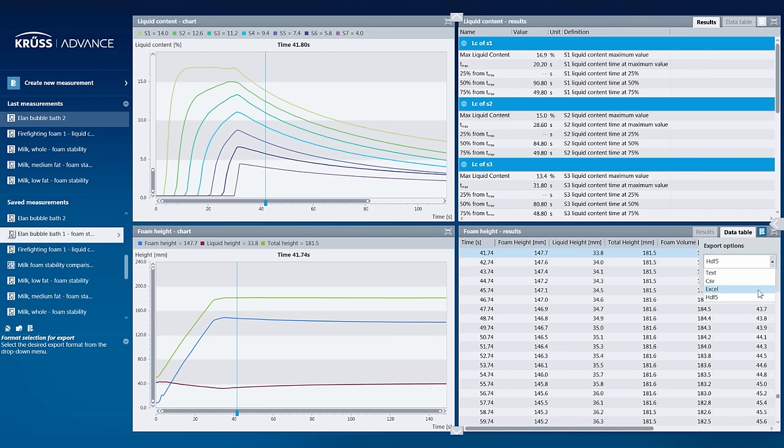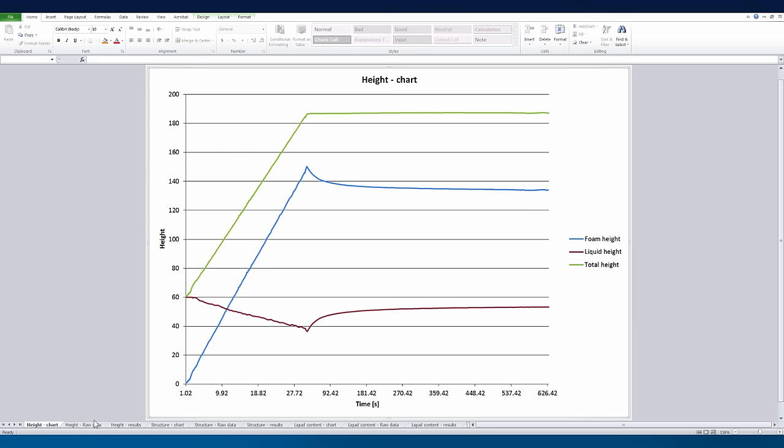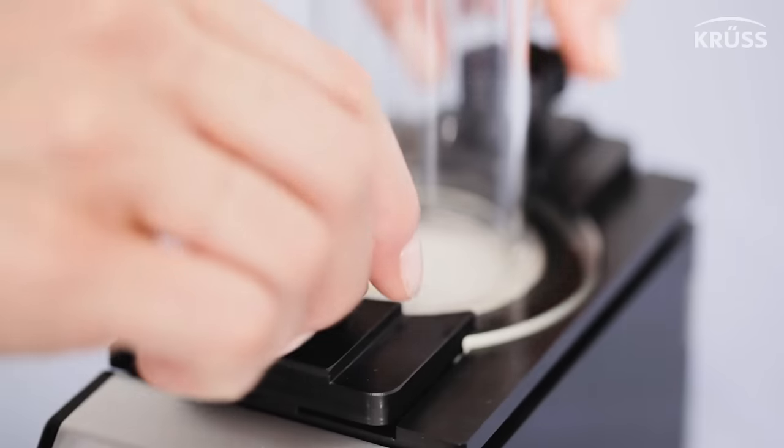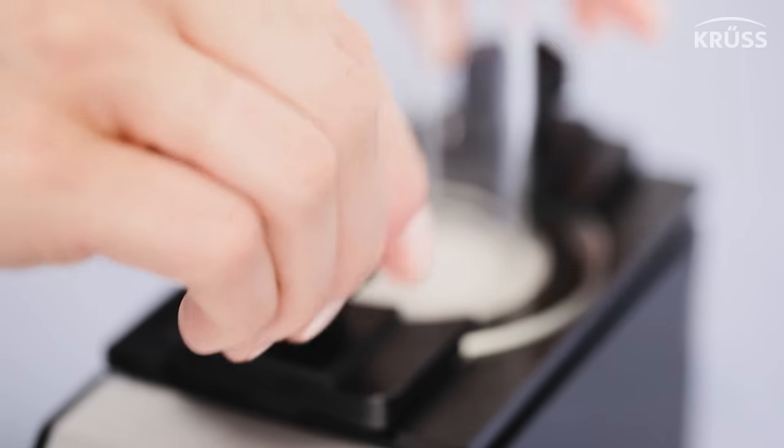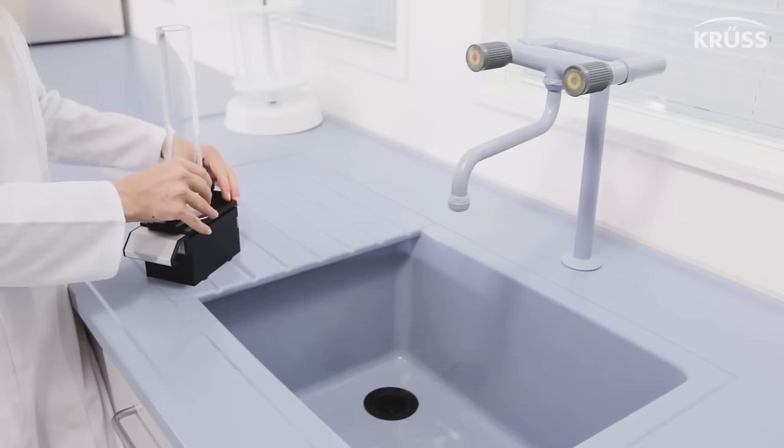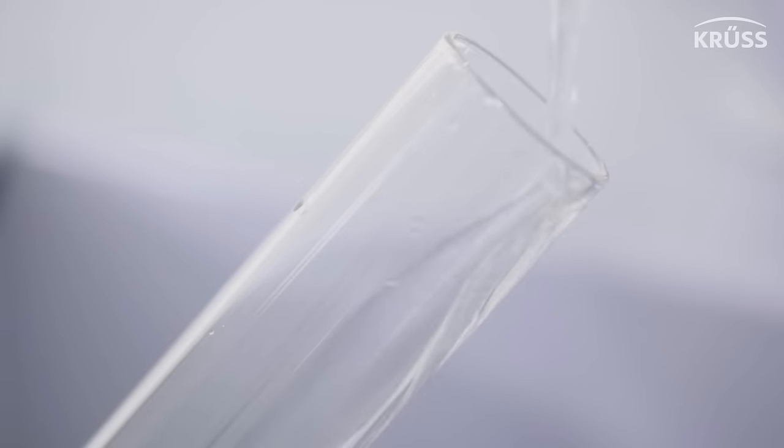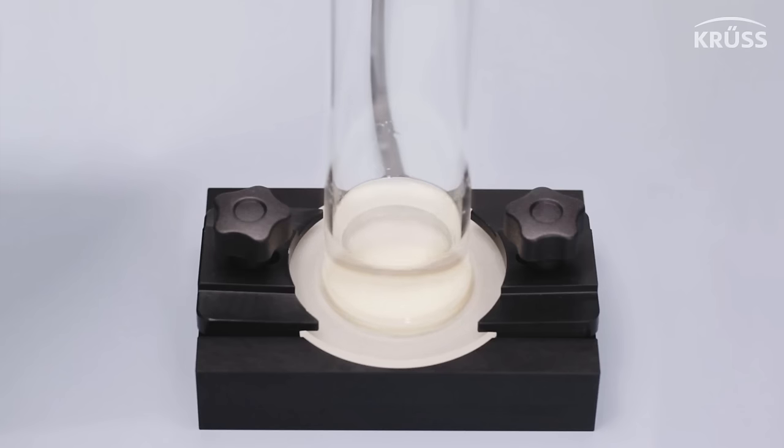If desired, even the raw data from the sensors can be saved. Once a measurement is finished, the DFA 100 can easily be cleaned. The measurement chamber can be completely removed from the system in seconds, and for the filter plates, we have a special vacuum cleaning device.